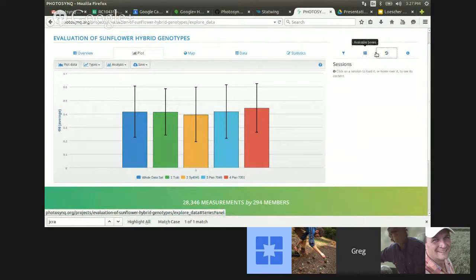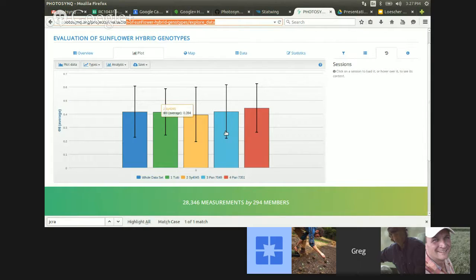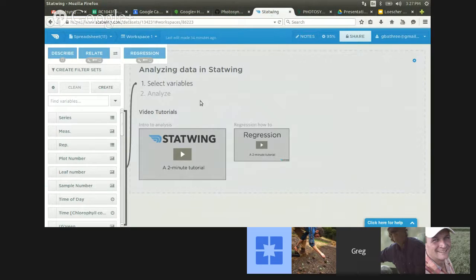You can actually save sessions and share them collaboratively. So instead of just taking a picture, like a screenshot, and sharing with this, you'd actually share a link, and they would load this page, and it would be an actionable page. They could click on things, sort of pick up right from where you left off. So we've been trying to focus on collaboration to develop this. But a lot of the time, because of the complexity of these measurements, you really have to do statistics. We can't see differences here, but can we see differences when we run statistics? So we've been doing that quite a bit.